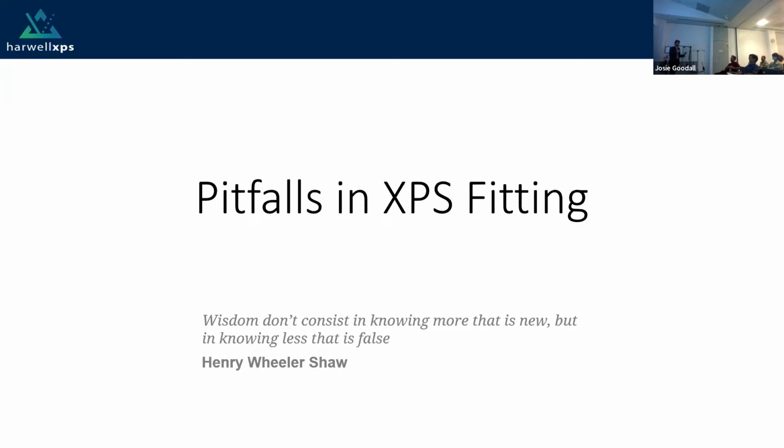Fatal errors are errors that completely undermine the conclusions of the study. I think about 4 or 5% of the papers had fatal errors, where they completely messed up their analysis. When people started fitting the data, that number went from about 4% of fatal errors to around 40%. Forty percent of data in leading journals is analysed completely incorrectly, which completely undermines the conclusions of the study.